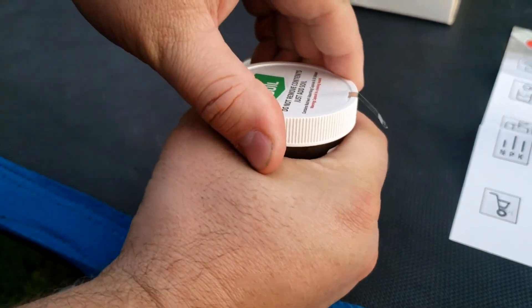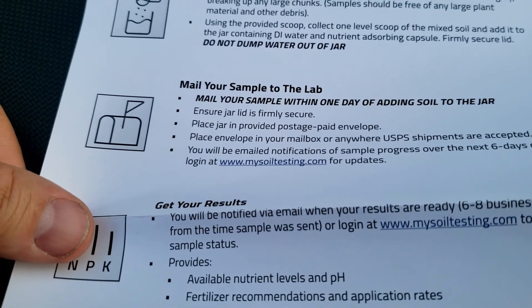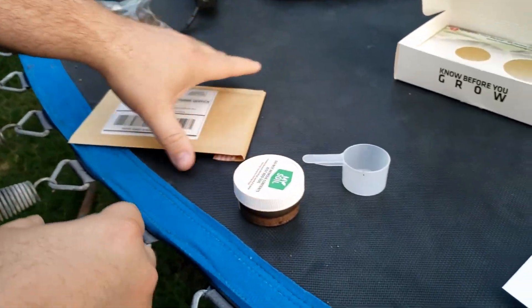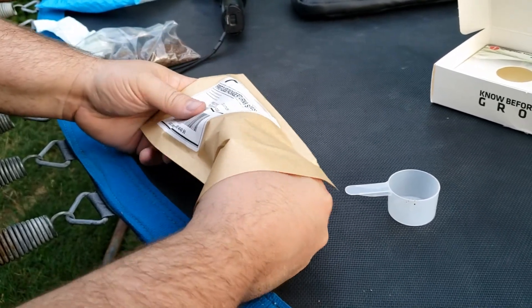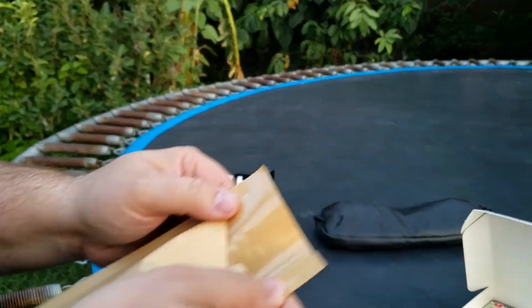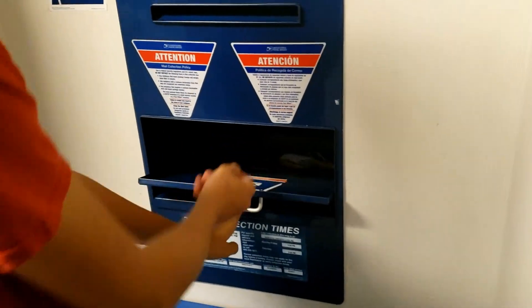Now we've got it sealed — we're going to put that back. It doesn't say to shake it or anything. Put it in the jar, make sure that lid is good and tight, put this in the first-class mail envelope.